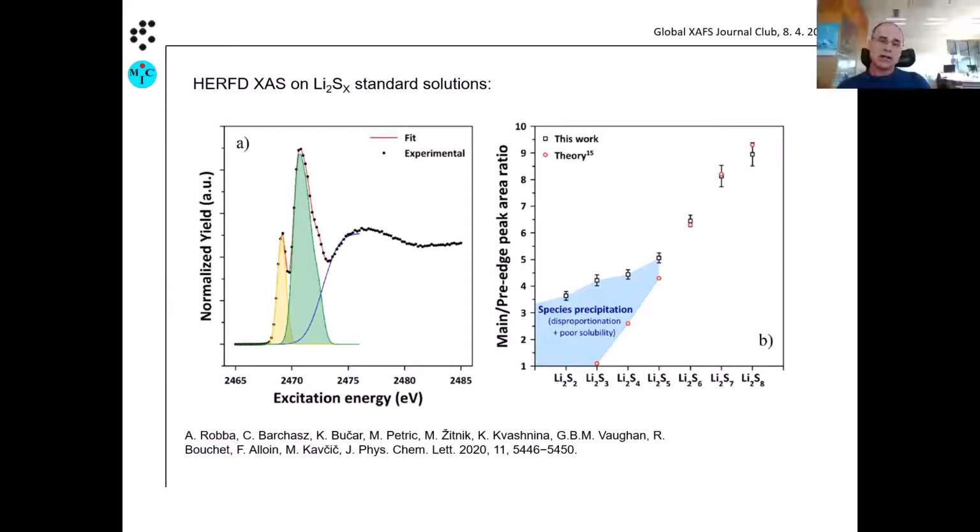No, but generally when we measure, typically we don't move. For example, we stay at one fixed position, and across the length of the detector, these variations are not really substantial. When you move from one angle to another angle, then of course there are bigger ones.